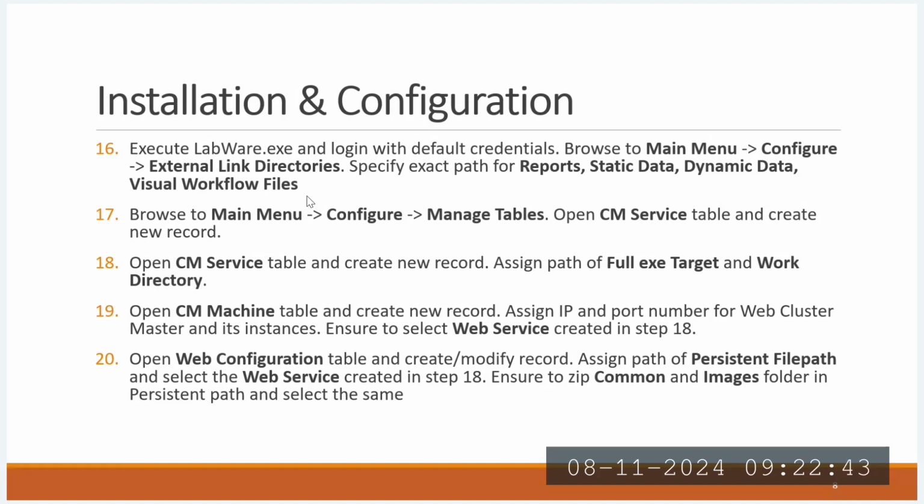Coming to visual workflows, the way the LabWare LIMS application presents itself will be part of the visual workflows technique. How dashboards look will all be controlled through visual workflows only.